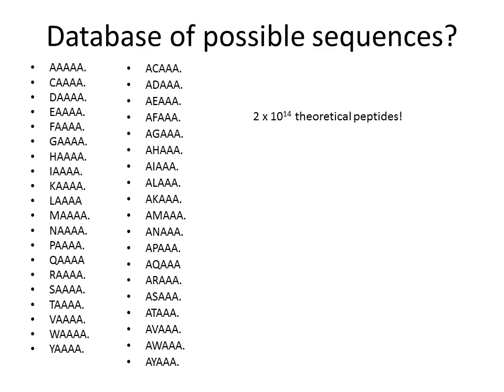We can restrict this a little by saying we only want tryptic peptides, sequences generated that end in lysine or arginine, but this still generates an enormous number of peptides. So another approach was thought of. In 1994, Jimmy Eng and John Yates published the solution.